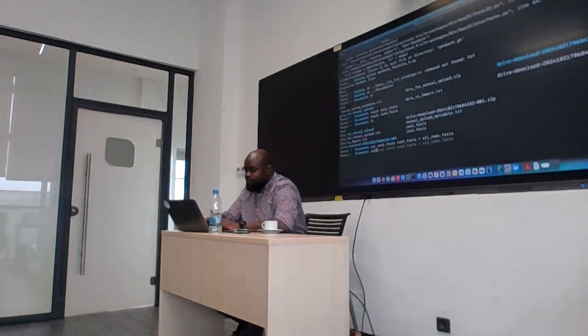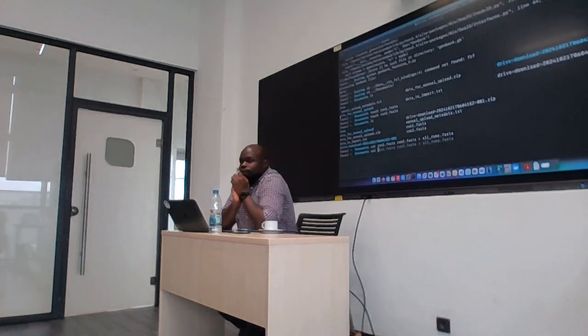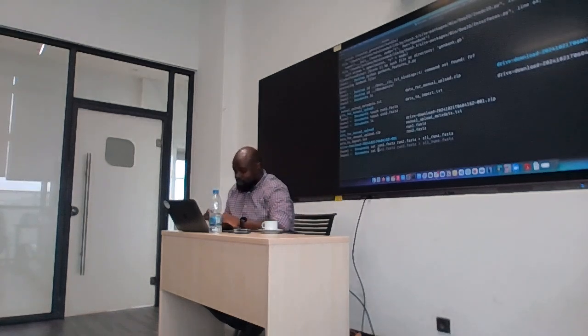I say cat, all the files that have the name star .fasta, and then I give it a name, right?